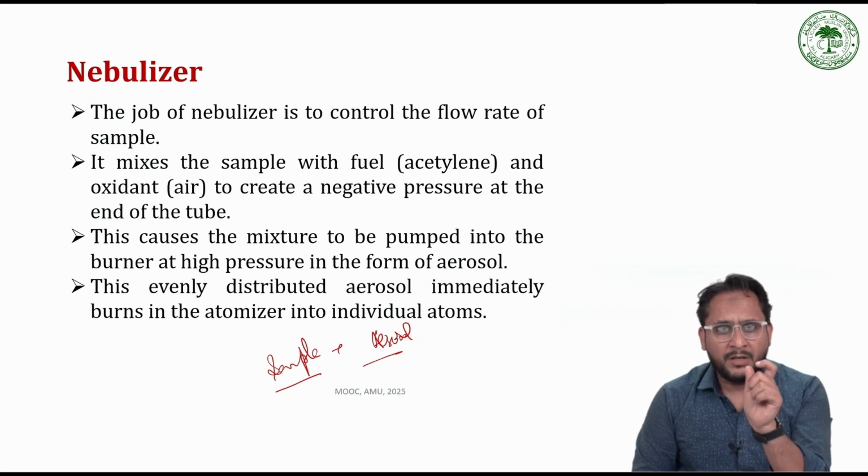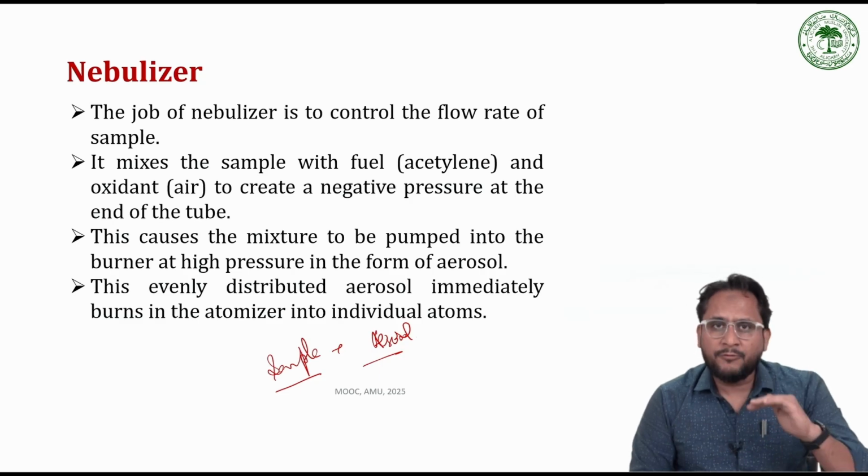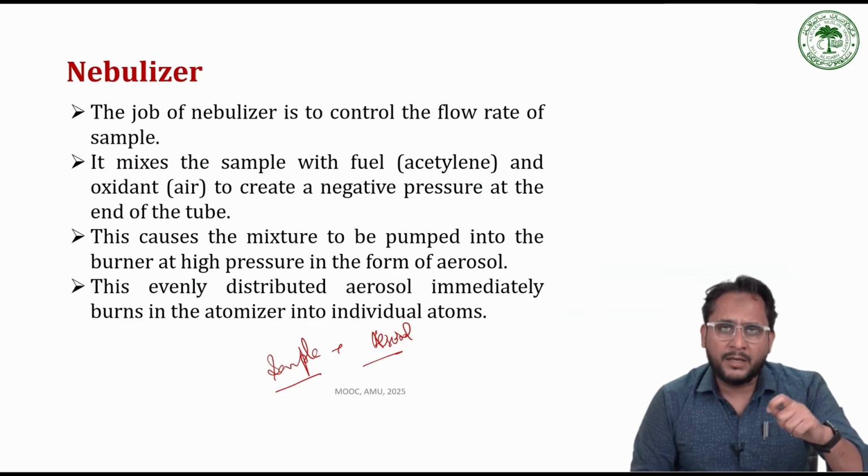So the flow rate of the sample should not be too high or too low.